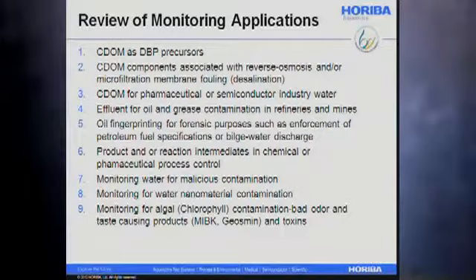There are a number of new regulations being established in terms of identifying specific sources for bilge water discharge and leakage of oil spills, product and reaction intermediates and chemical and pharmaceutical process control, monitoring water for malicious contamination, water for nanomaterial contamination, algal and chlorophyll, as I mentioned before.